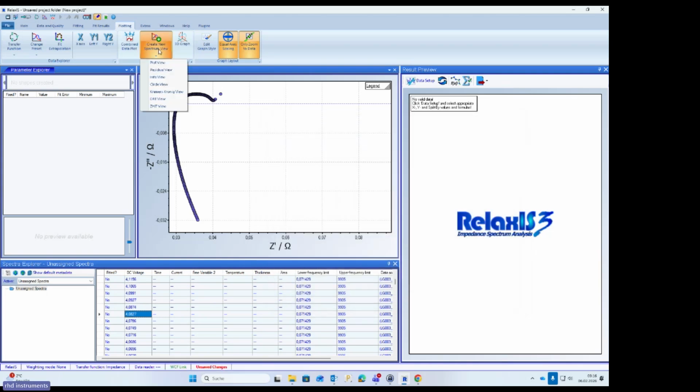This you can do. You can also create, once we have performed a fit, so now we haven't performed the fit, but later you can also show a window where you will always see the residuals of the fit, or what we call here info view, the statistics of the fit. Or if you want to add graphical elements, you can also visualize this. This here is pretty interesting.